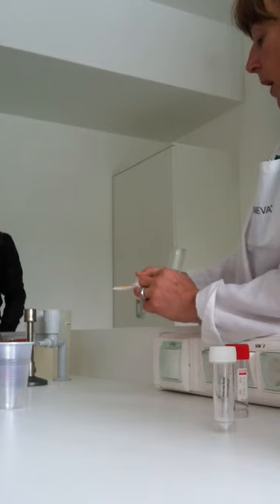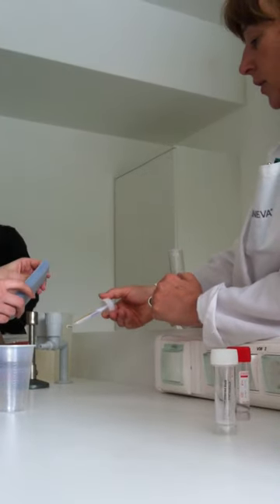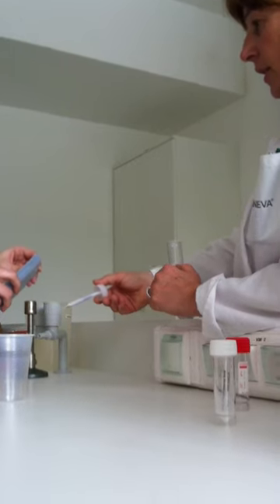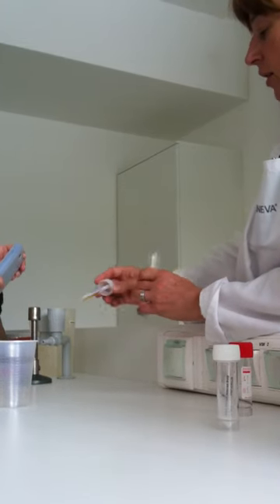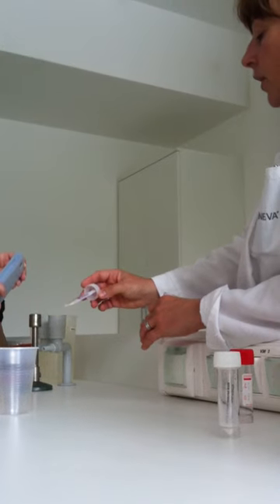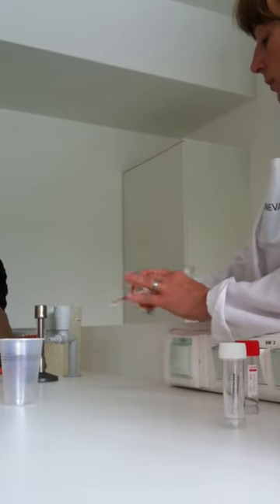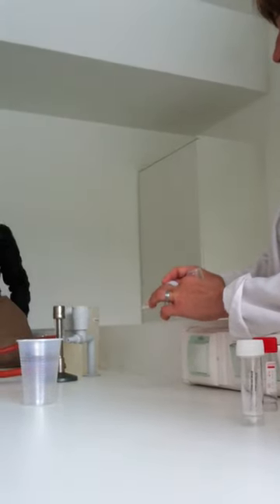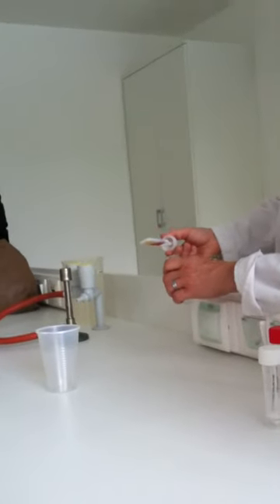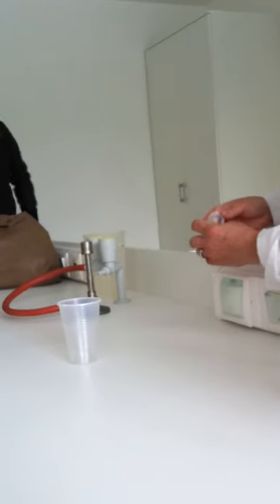There are three different parts. One part is not divided, and this is good for every bacterium. Currently you can see bacteria on this, but normally it's sterile, without any colony. There is also a fungus on this, Aspergillus. The other part is divided, the red is McConkey's, similar to eosin methylene blue, suitable for gram negatives, and the pale part is suitable for gram positives, and this is for all. Candida can also grow, so fungi can grow and bacteria can grow. Not every bacterium can grow, for example, Mycoplasma and Chlamydia do not.